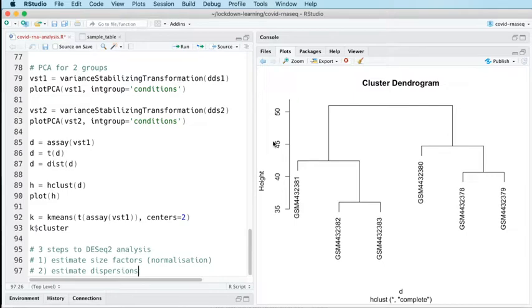And so what DESeq2 does, which is very clever, is it uses the variance across your whole experiment. So not just the 6 observations for a single gene, but the 6 observations for 60,000 genes to submit its dispersion estimates to what's called shrinkage. So it takes your measurements for one gene and compares them to measurements for all of the other genes, and it borrows information about the variance from those other genes to shrink the estimate of variance for the gene that it's currently considering.